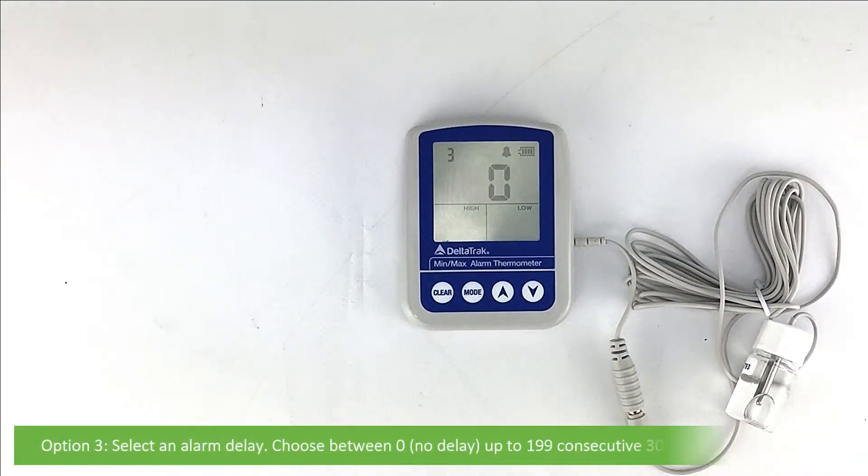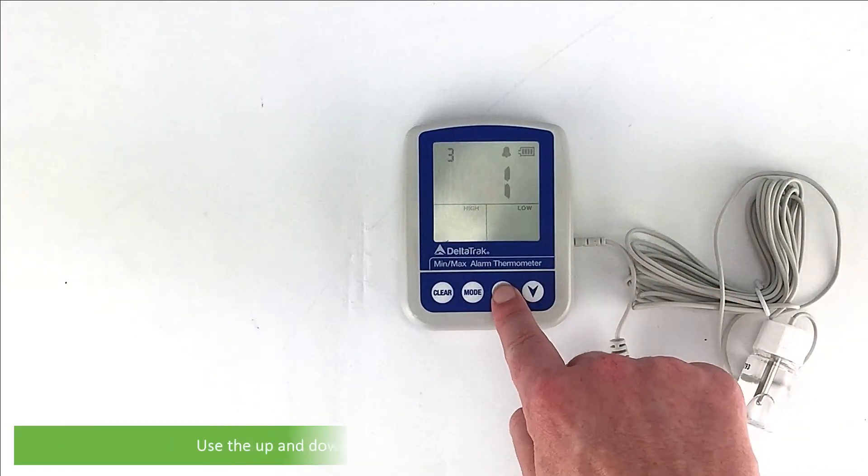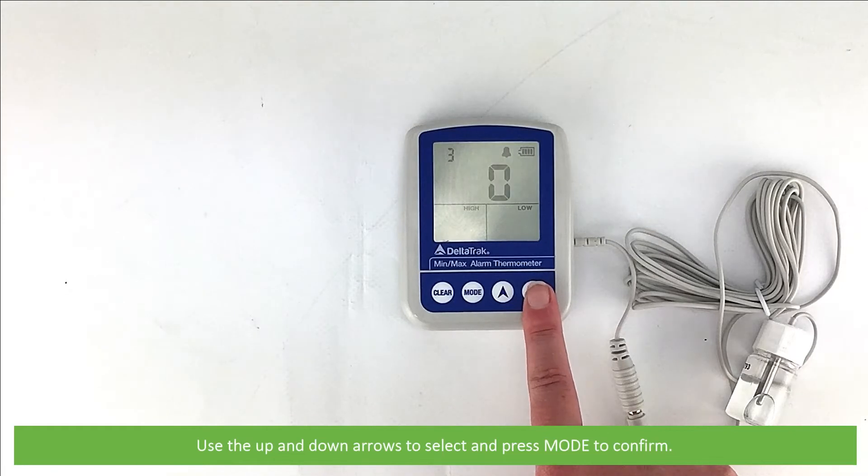Option 3 is to select an alarm delay. Choose between 0, which is no delay, up to 199 consecutive 30-second delay intervals. Use the up and down arrows to select and Mode to confirm.